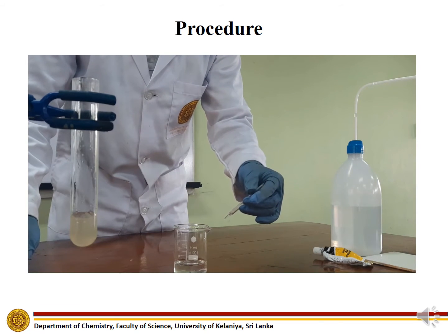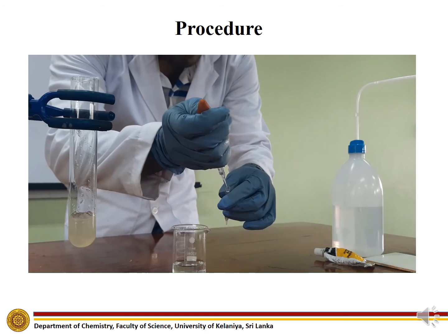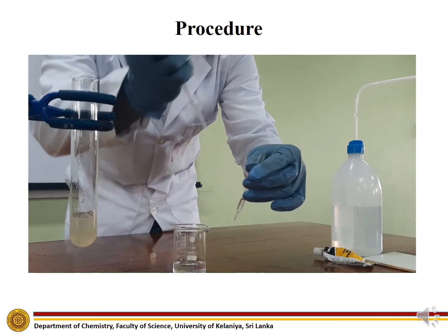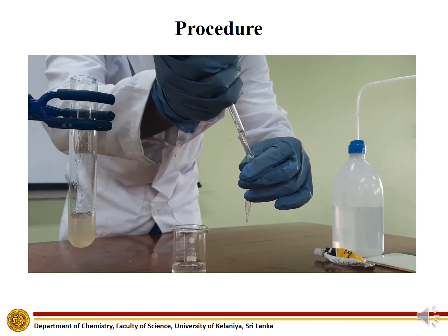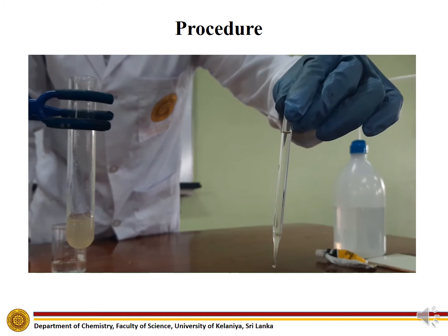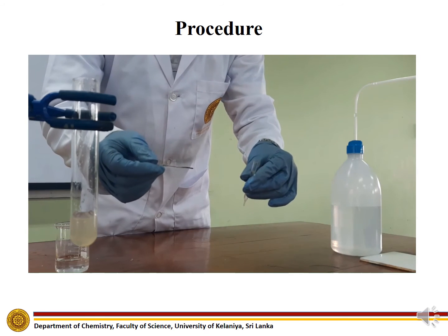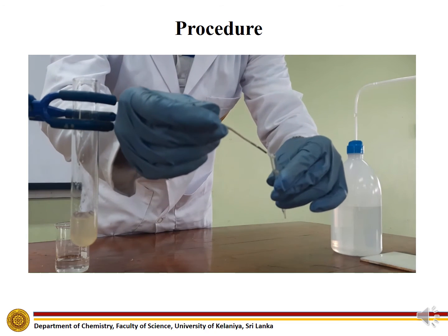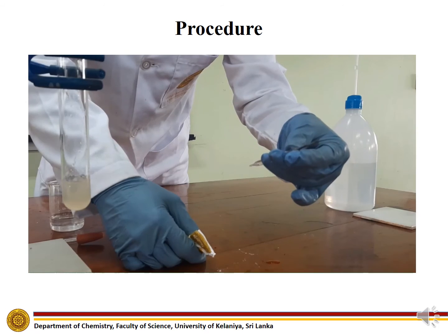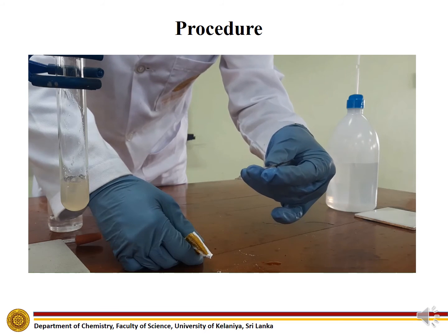Fill the glass tube with saturated potassium chloride solution and fix the silver wire to the glass tube. Then seal the upper end of the glass tube with silicone sealer.